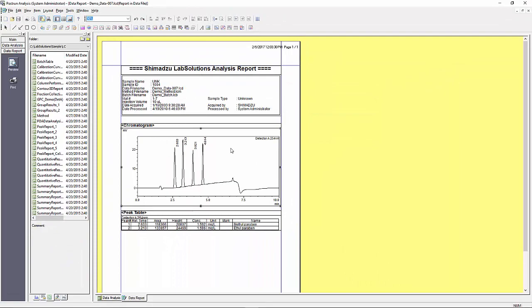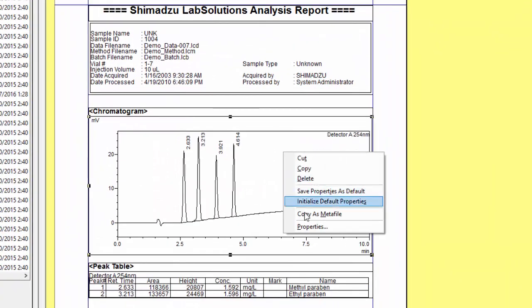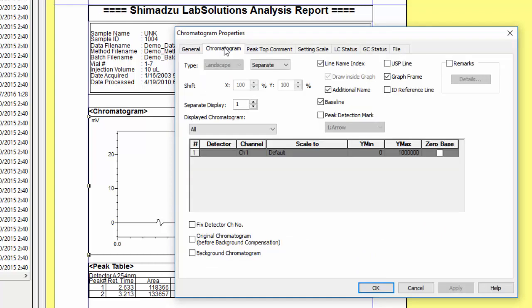Next, in this example I'm right-clicking on the chromatogram and selecting properties. Under the chromatogram tab you can select which detector and/or channel you would like to display. You also have options for specific visuals on the chromatogram such as baseline and peak detection mark. Additionally you can have the scale automatically defined based on the range of data.